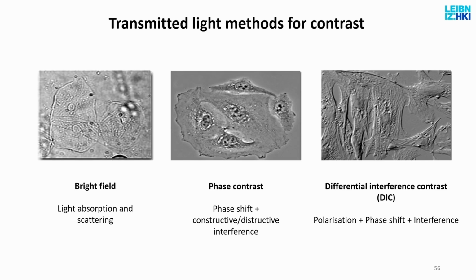In phase contrast, you take advantage of the effect of interference, where the light just outside the edge of the cell, for example, and just inside the cell will go through slightly different light paths. The light beam that goes through the cell goes through some fatty tissue, so this is numerically different. Light that goes through right next to it does not have that, and then when you interfere that, you will see an interference pattern which will emphasize the edges. And that's what you get with a phase contrast microscope, an enhancement of the edges.